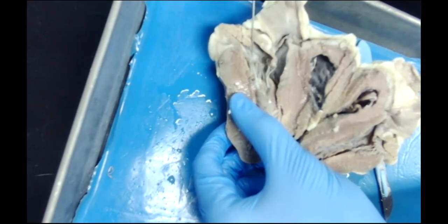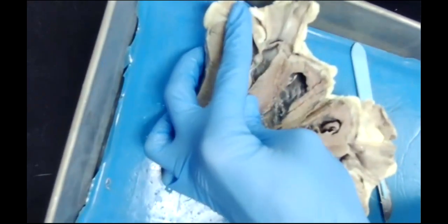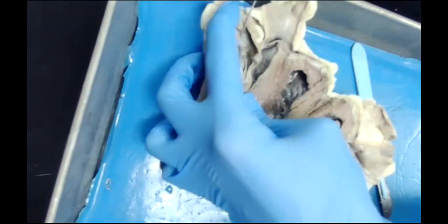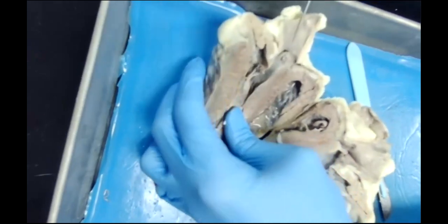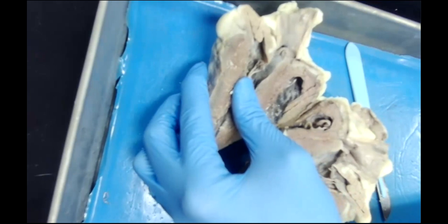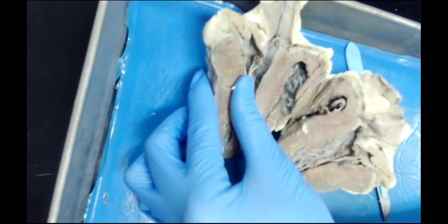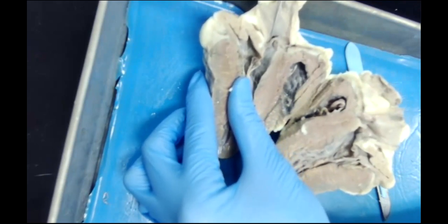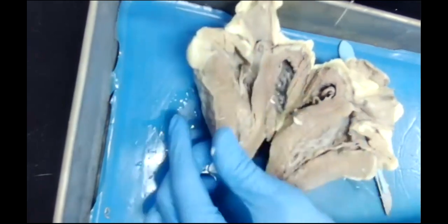So here we have our left atrioventricular valve. We can also see our aortic semilunar valve right here. Notice that its structure is quite a bit different here. That's because this vessel is going to be subject to ridiculous amounts of force coming through it. So we're going to have really high blood pressures here, but these blood pressures are so high that it's really unlikely for blood to fall backwards this way. We just need it to open or just hold itself closed a little bit with these semilunar valves down here.